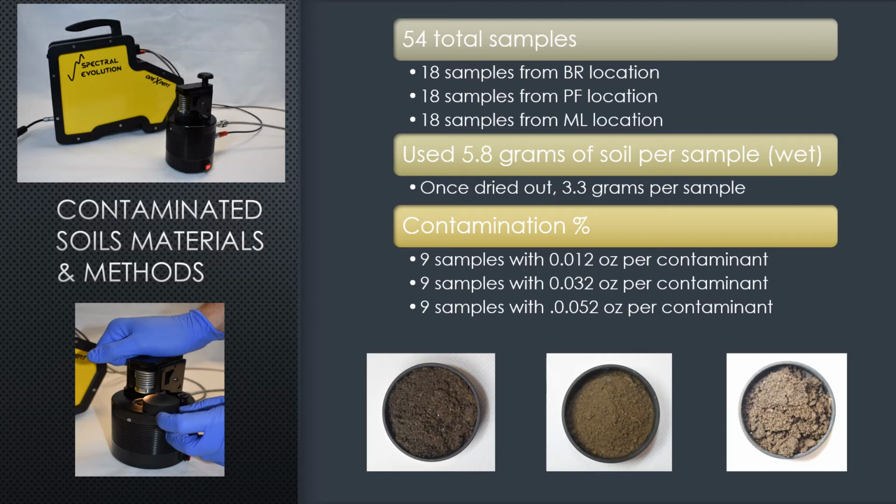Now this was done by putting each soil sample into a sample tray, then adding the measured out contaminant. It was then compacted down. The benchtop probe light source was used with the ORExpert to acquire these sample spectra.